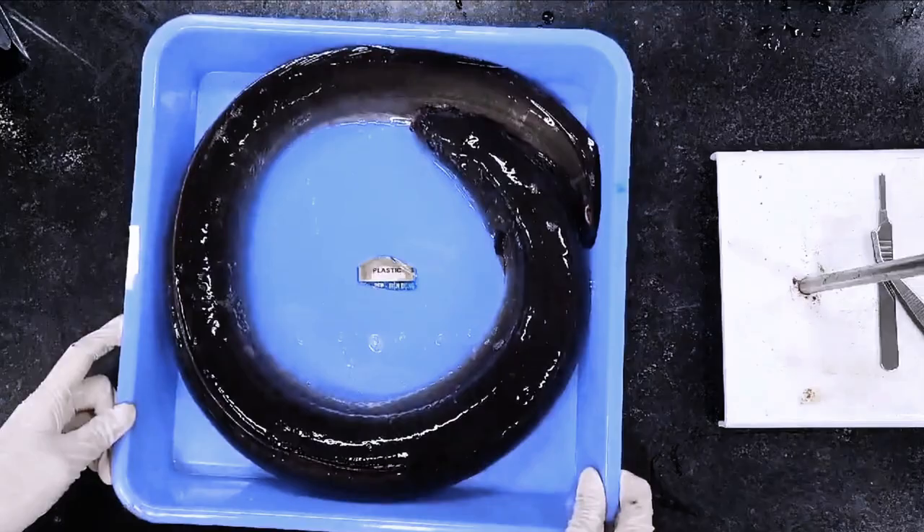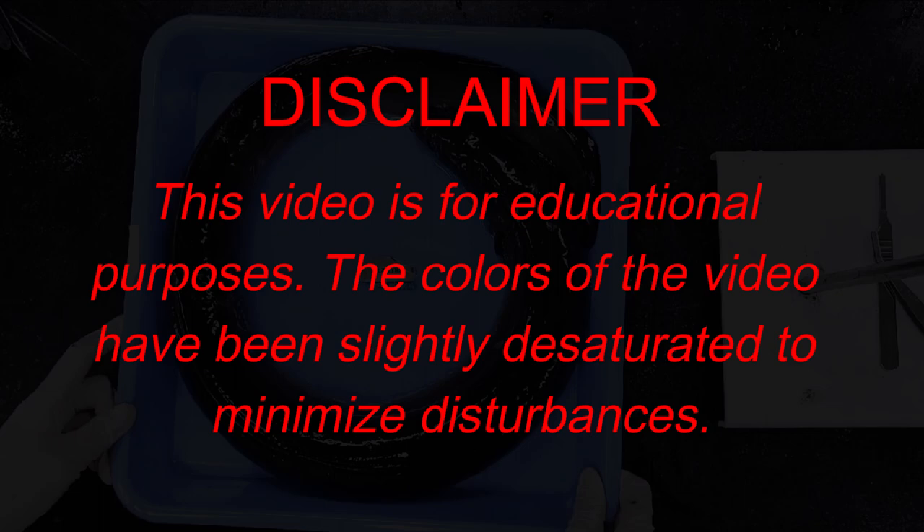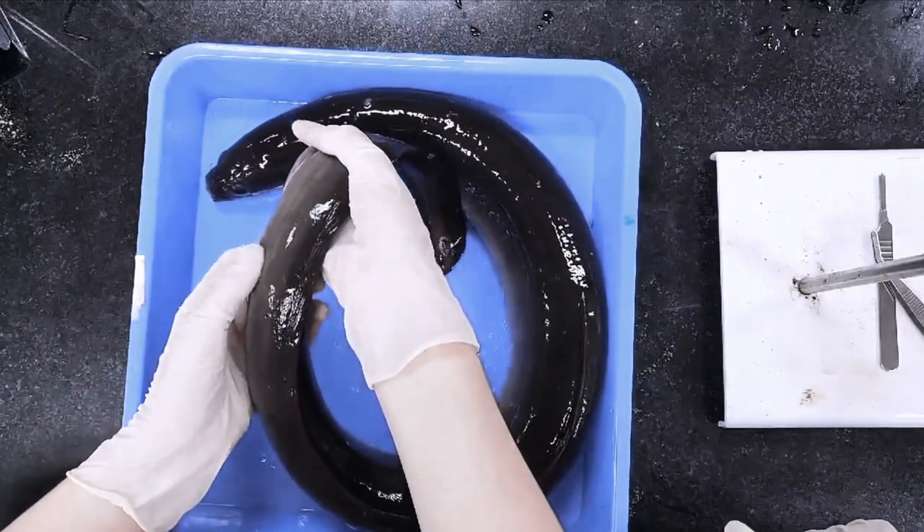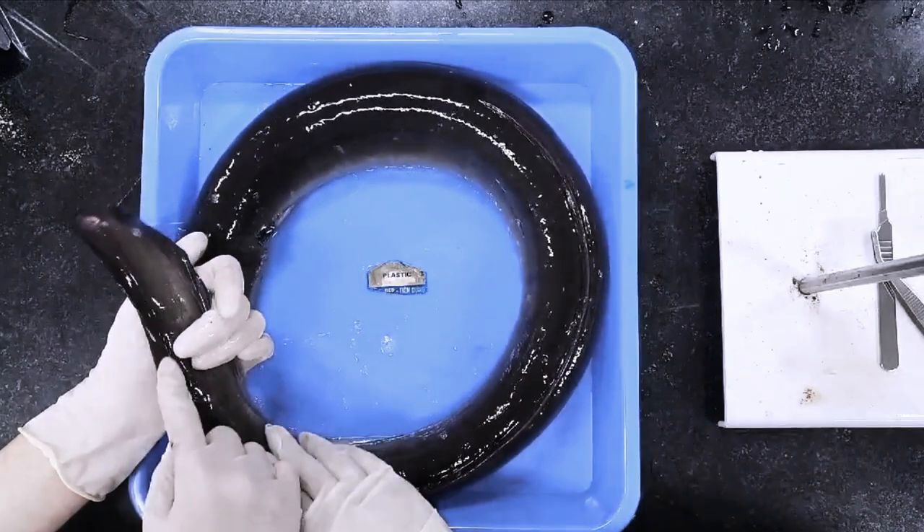Let's start with the dissection. Starting with the external structures, the tail tip is surrounded by a continuous dorsal, anal, and caudal fin.